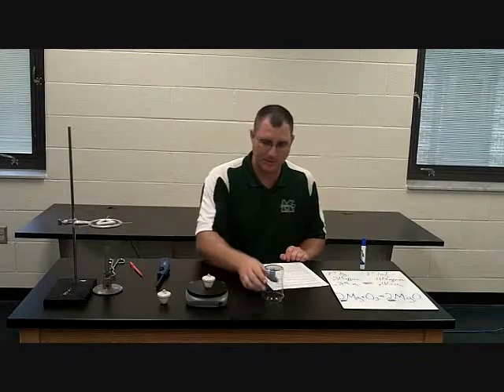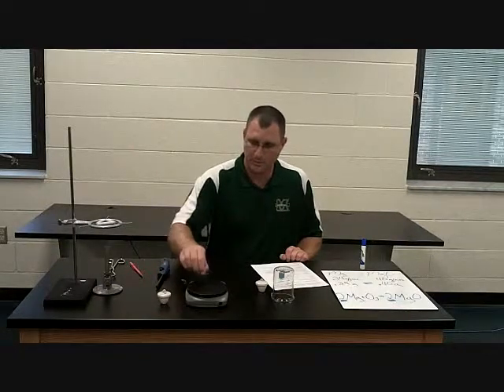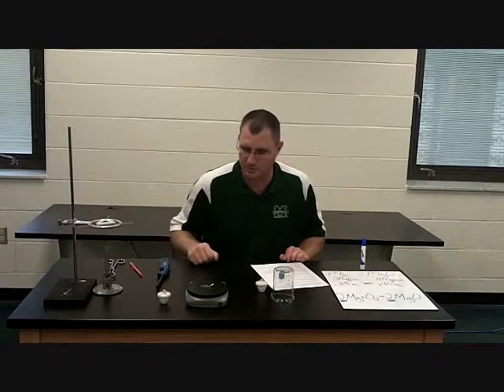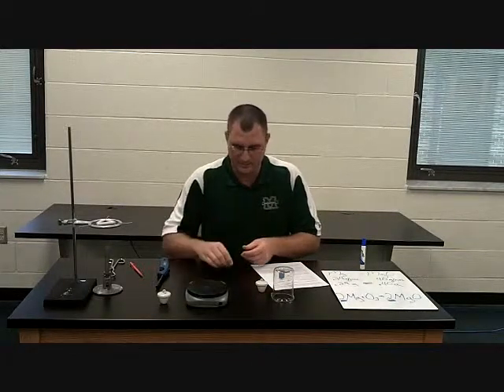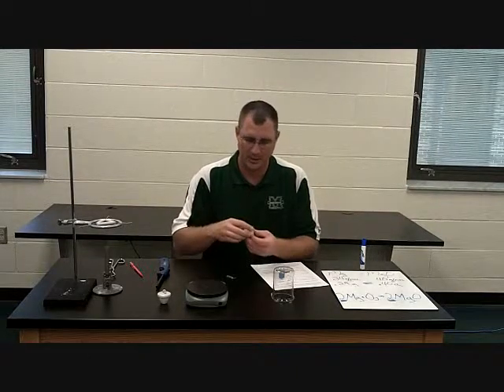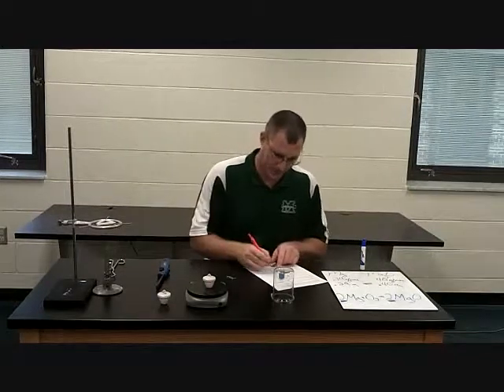Now the next step of this lab is you're going to take your scale here and you're going to zero it out, and you're going to place magnesium on it until you get up to 0.24 grams, or as close as you can. Okay, so there's 0.24 grams for me. So once I have that, I'm going to take a crucible and lid, and I'm going to weigh them, and I'm going to record that measurement.